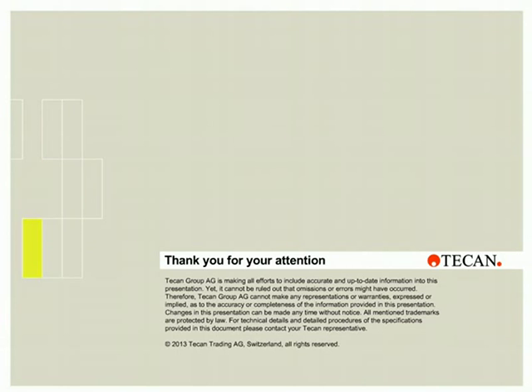So maybe I will also comment on this, but I think also Jens can share his experiences with our multi-mode reader. So no, the reader itself and the i-control software allows you to do a real multiplexing. That means that with a single measurement protocol, you can include all the measurements needed. That means you can do an absorbance, a fluorescence or luminescence measurement all together in one single measurement protocol. You don't need to run multiple scripts or to interfere somehow manually. And maybe Jens, do you want to comment on this question as well?